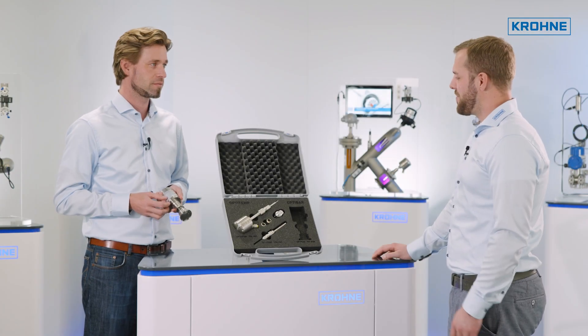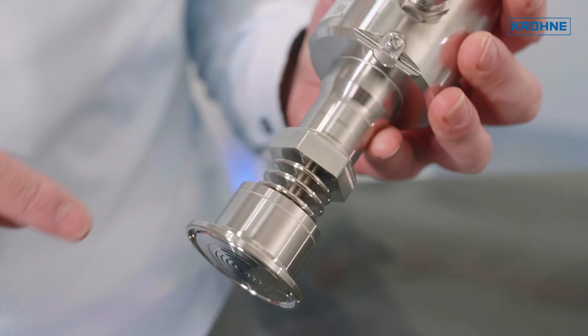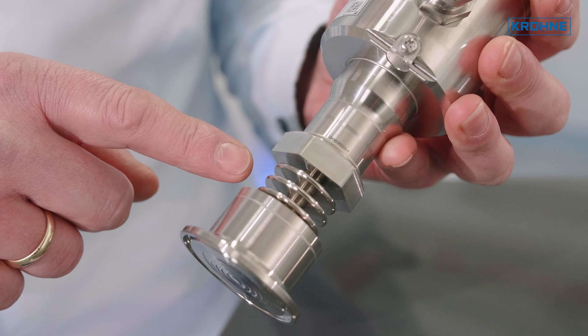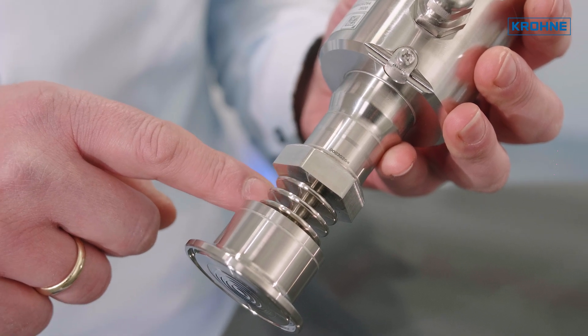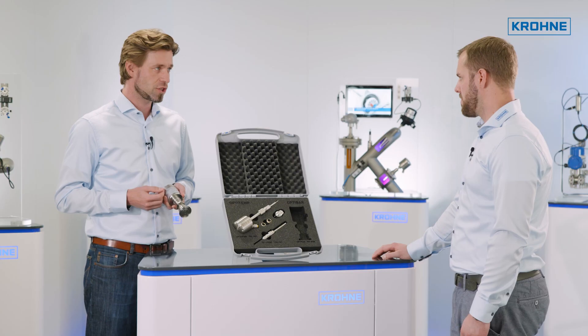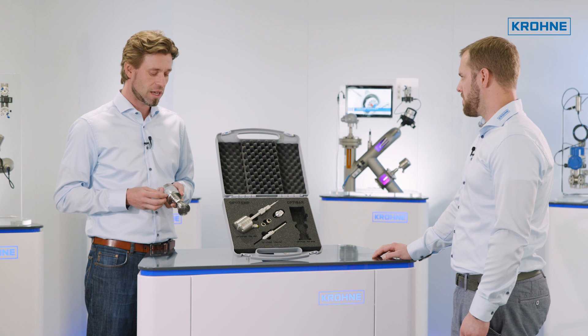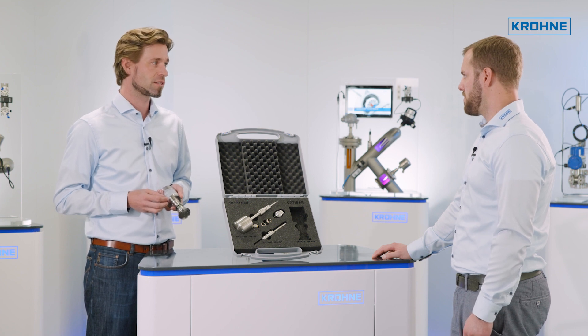What is the advantage of the design with these cooling fins? The cooling fins provide an additional cooling through the enlarged surface. There is a temperature decoupling from the process to the electronics so you can use the device in process conditions with temperatures as high as 150 degrees C, which is 302 degrees Fahrenheit, even in SIP or CIP cycles.